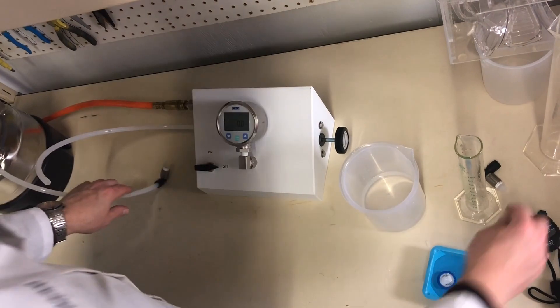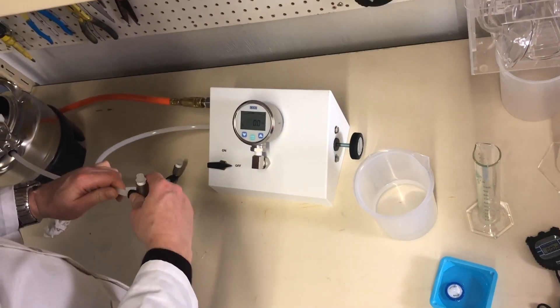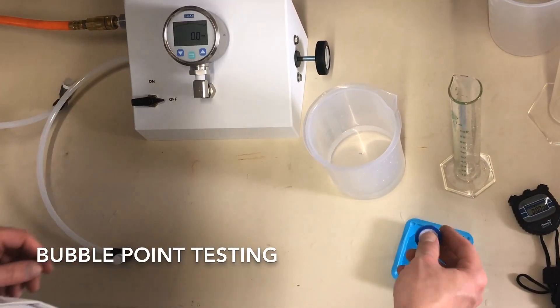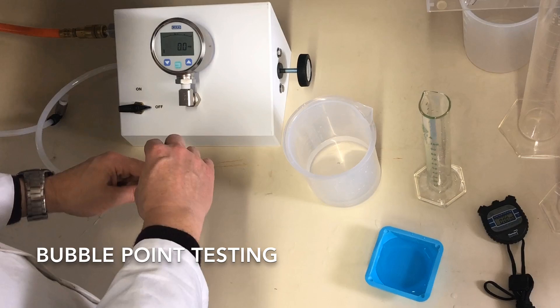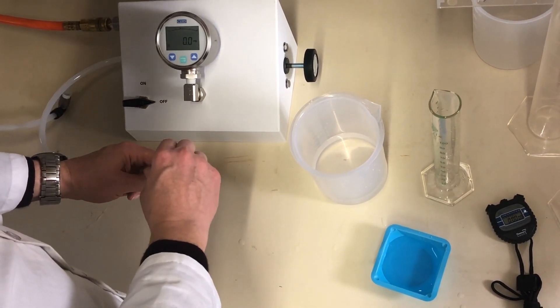Then we'll attach the test fitting back to the end of the outlet tubing — the bubble-point tester outlet tubing. Take our previously flow-tested filter. We'll make sure the outlet fitting is facing upward. We'll attach the wetted filter by screwing it on clockwise until it's firm.